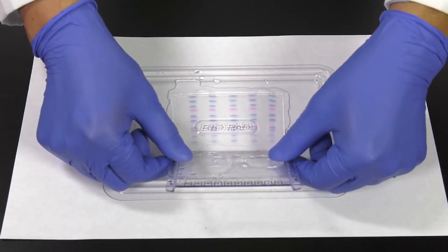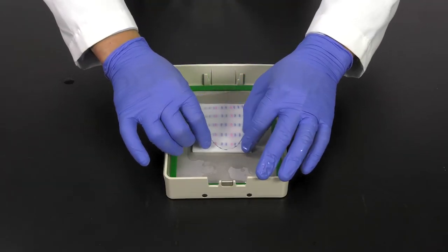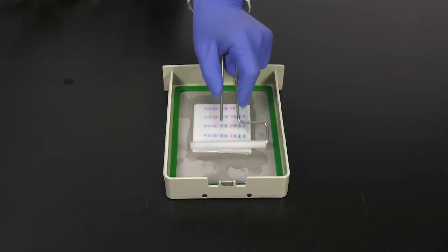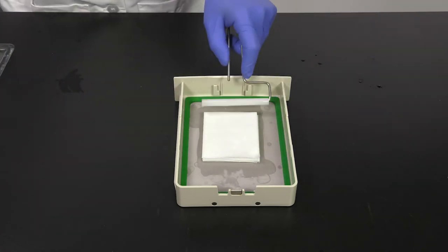Next, take your gel, cut off the wells with a straight edge, and place it on top of the membrane. Roll the stack again. Next, place the top stack over the gel and roll again to remove air bubbles.